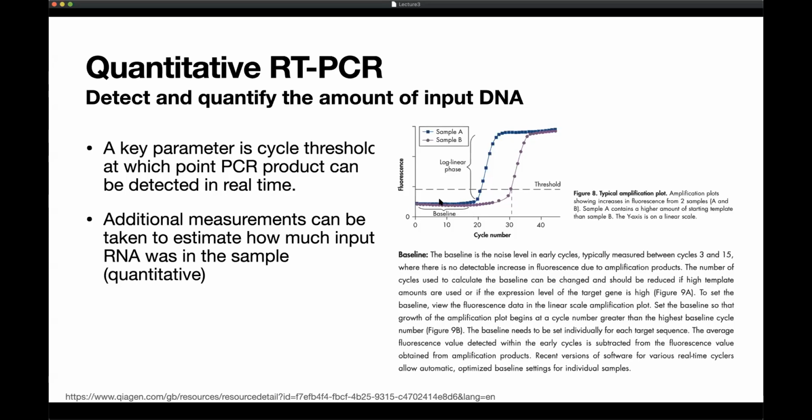If your PCR experiment is designed properly, you start with a very small amount of DNA here, cycle time 0. There's a threshold that is a limit of detection. So your optics are not able to see any light until there's enough fluorophores being released by hybridization and elongation that they make a strong enough signal.